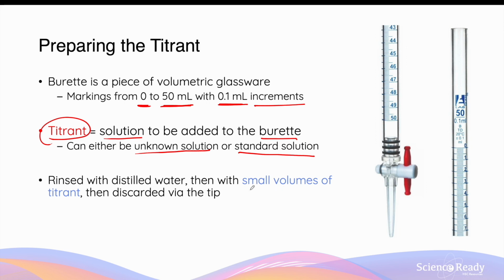It is okay for a small amount of titrant to be left over after rinsing, because it will have the same concentration as the titrant that you're about to add in. Any residual amount of titrant will not affect the concentration of the titrant that will be in the burette.